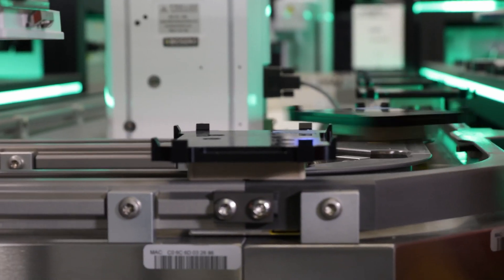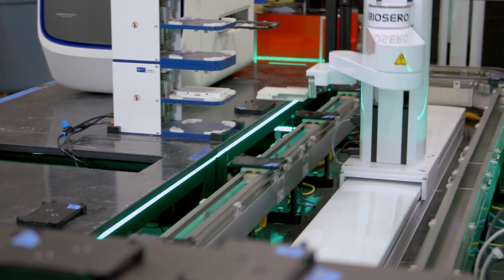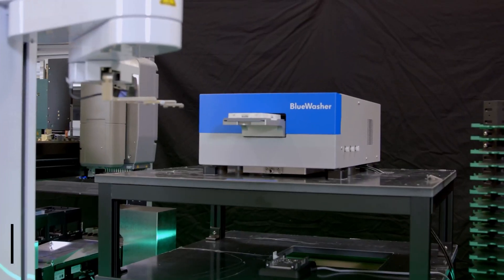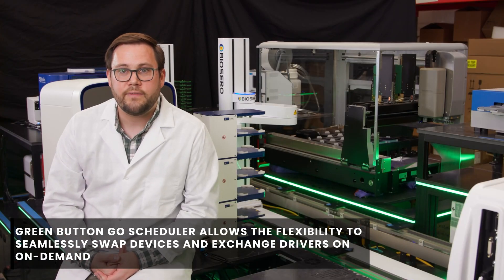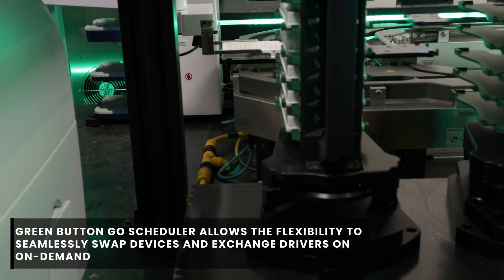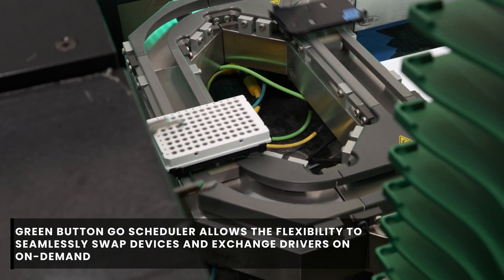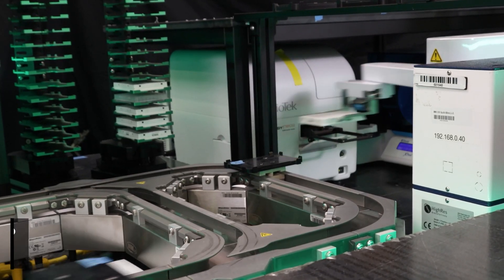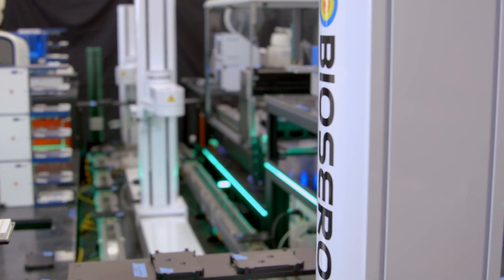This system is also designed for increased flexibility across any of the instruments you may see. As time progresses, you may imagine that one of the plate washers in the system isn't compatible with any of the assays that you're running. BioSero's Green Button Go software makes it very easy to pull out and swap these instruments even mid-run if required, to make sure that at any time you're getting the most out of the automation integrated into your lab. The end result of all this is to make sure that the data-driven decisions powering your laboratory research are supported by the most robust and efficient automation scheduling software available: BioSero's Green Button Go.